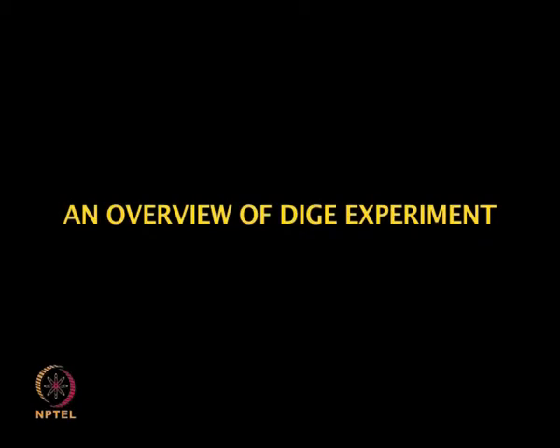So Dr. Srinivas, it was very useful to get a glimpse of the overall process in DIGE technology. Would you like to elaborate or demonstrate in more detail the steps involved in the labeling of this technology? Yes, there is another video you can see now. This is the second video, where you can see it more elaborately. This is a protocol developed for membrane protein analysis. Now you can see this video.